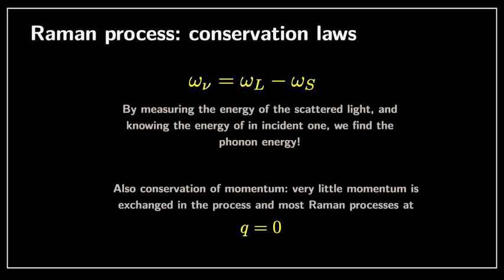As you know, there is extremely little momentum exchange in this process, simply because the values of the momenta are so different that there is very little possibility to exchange momentum. And so the most likely case, in this one-phonon process, in order for the momentum to be conserved, is that the momentum of the phonon is zero.